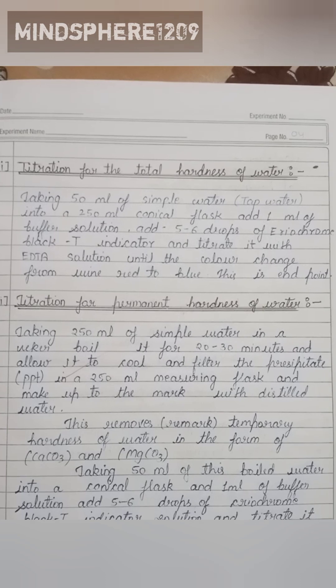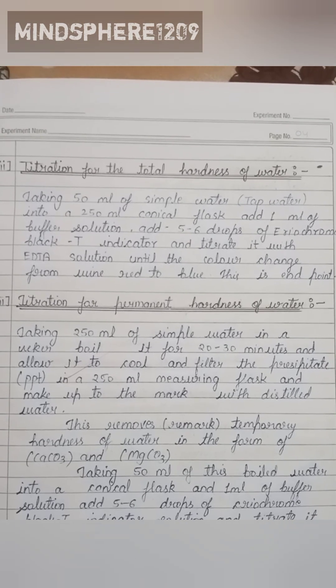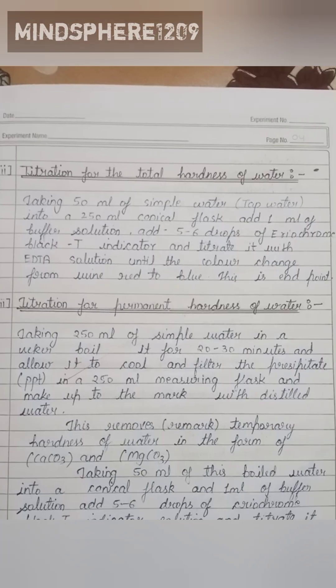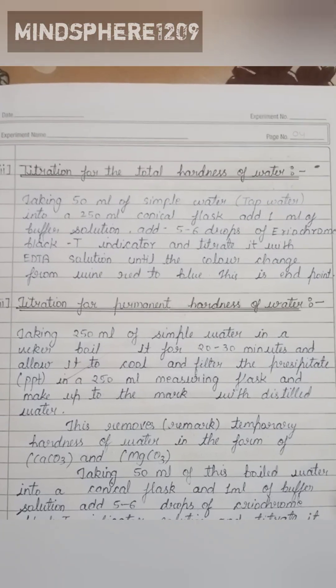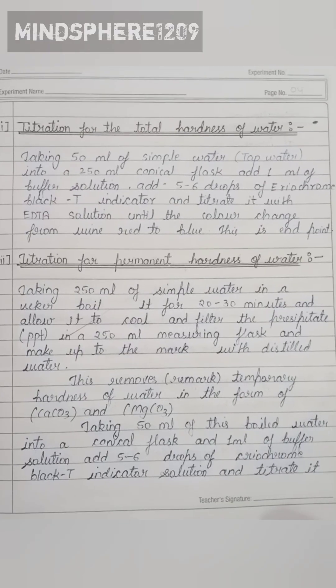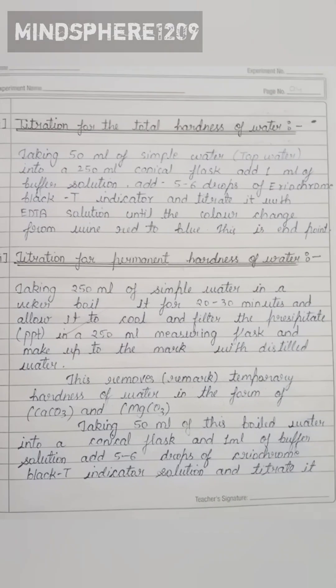Titrate the solution with EDTA until the color changes from red to blue. The third step is titration for the permanent hardness of water.